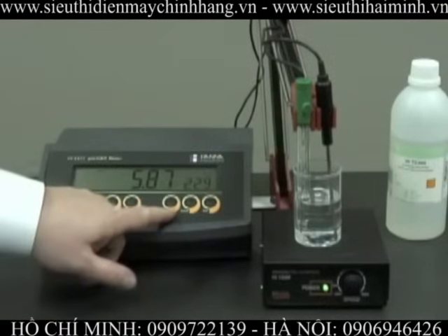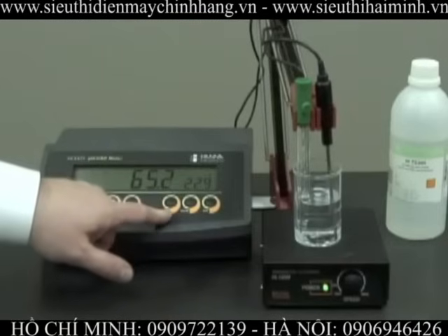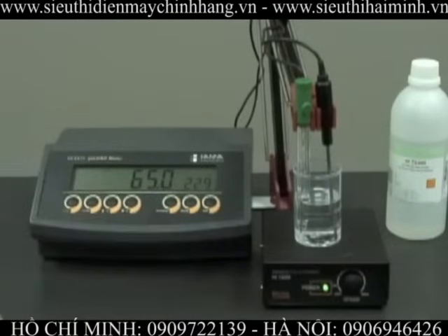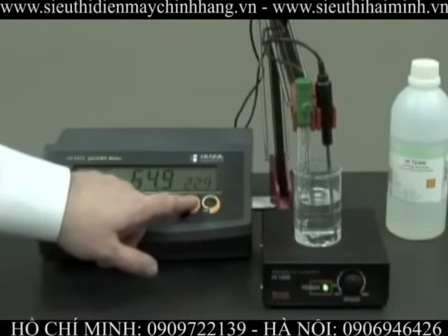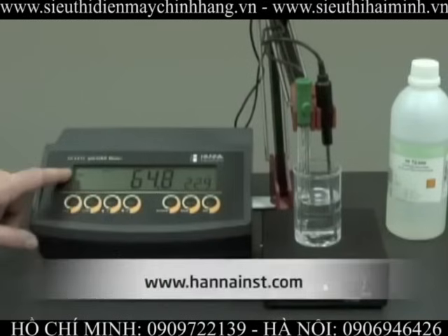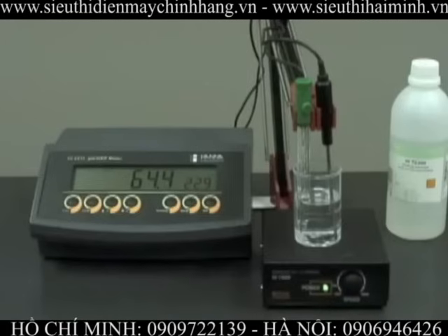The range button will allow us to see the reading in pH or millivolt using the pH electrode. We can also use an optional ORP electrode. The memory button stores the reading, and the memory recall button pulls up the last reading stored.